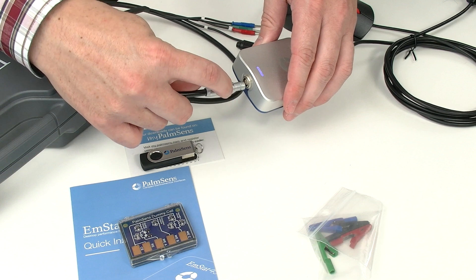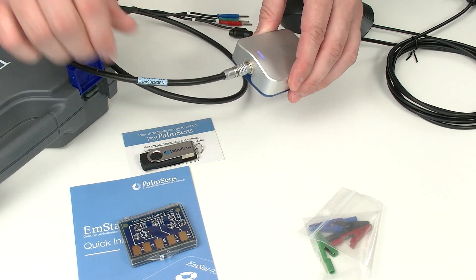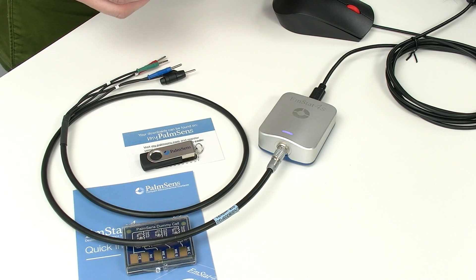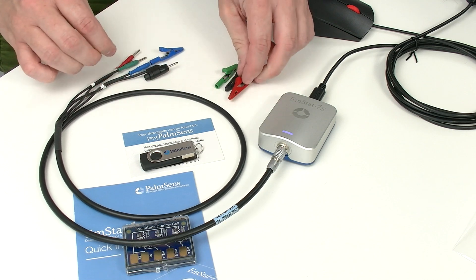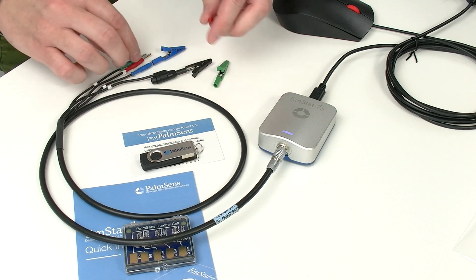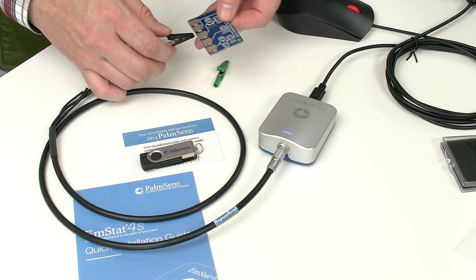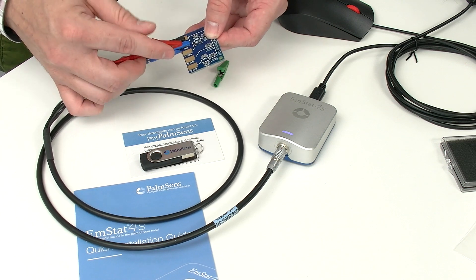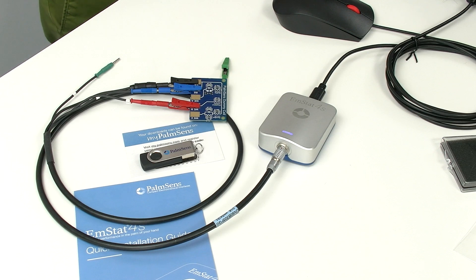To connect the dummy cell, we connect this limo plug. Take care that the red dot is on top, then just push it in and it's fixed. If you want to pull it out, you need to pull the ring. Then I use the crocodile clips to connect the dummy cell: the blue clip for the reference electrode, the black clip for the counter electrode, and the red clip for the working electrode. I take the dummy cell and connect the electrodes to the corresponding contact pads. We're going to use working electrode B, which is just a simple resistor — very nice for test measurements because you know exactly what to expect.